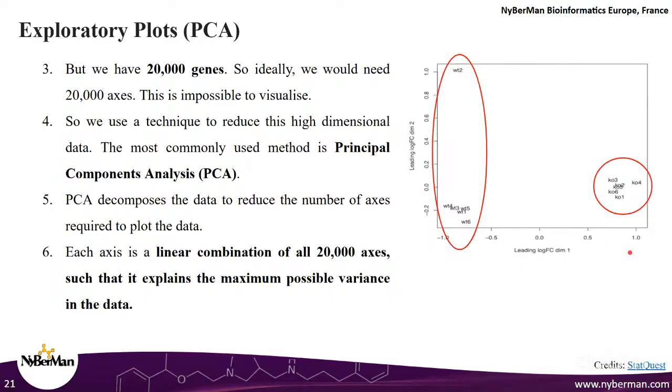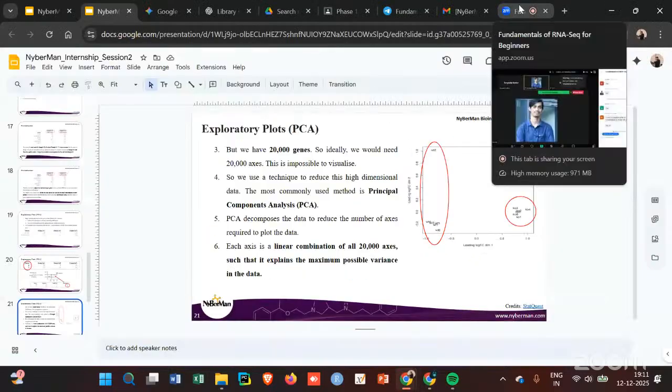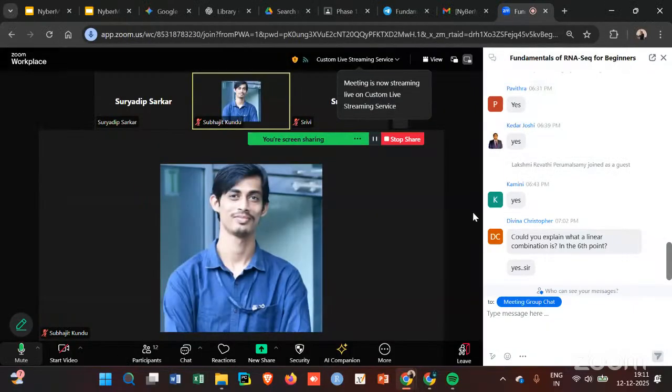So, two questions PCA promised to answer. One was whether we can actually find some interesting difference. It looks like we can. And whether we should exclude some of the samples from further analysis. It looks like we have to exclude WT2. Does everybody understand how you interpret a PCA plot in terms of your RNA-seq analysis, and how you can use it as an exploratory or diagnostic plot even before you begin doing any statistics? Yes, people understand the inferences?